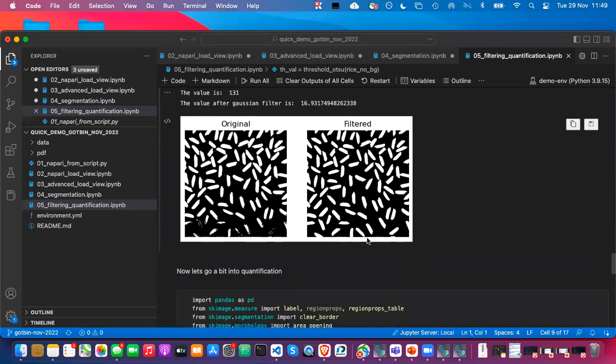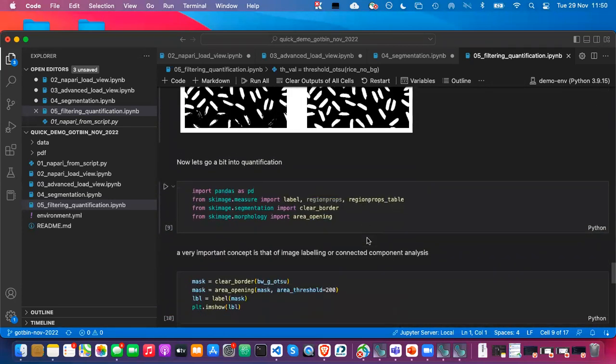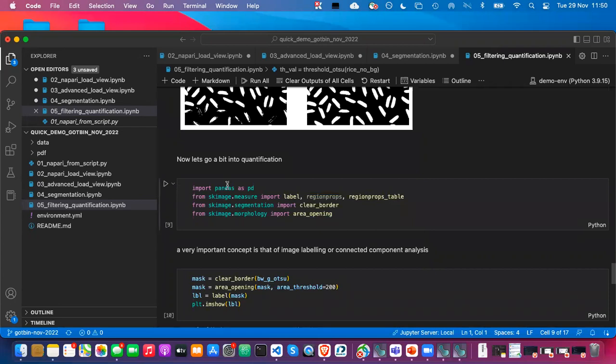All right. After that, I also want to show you that I love pandas. So all of this stuff is compatible with pandas. You know, down with Excel, love pandas. Just as a side joke, really. But the good thing is that now, if you use scikit-image, you can actually measure properties based on that segmentation, and all of that can be easily imported into a pandas data frame, and then you can do all your data mining afterwards in there, which is a lot easier, right?